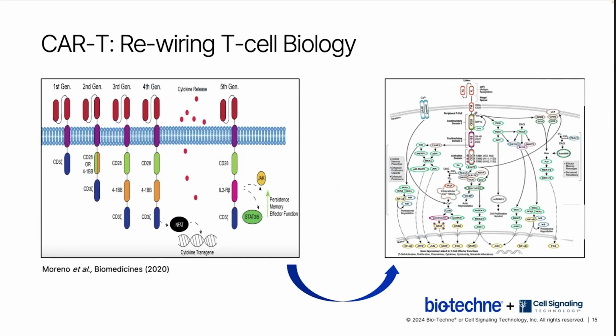The field of synthetic biology has equipped cell engineers with more tools than ever before to enable the development of novel CARs and gene circuits that are capable of rewiring T cell biology with the aim of developing therapeutic cellular platforms with enhanced persistence and effector functions.